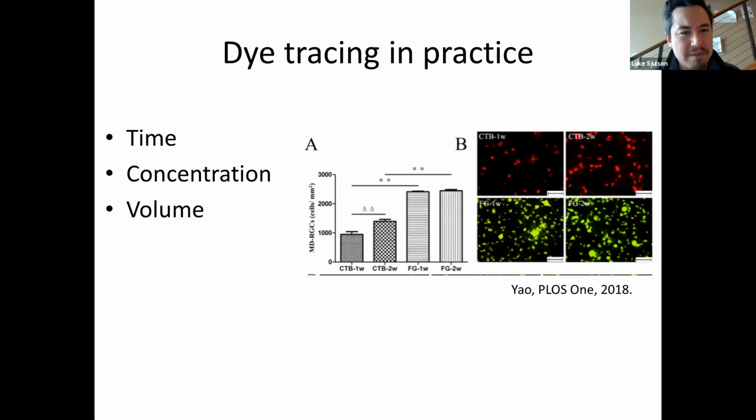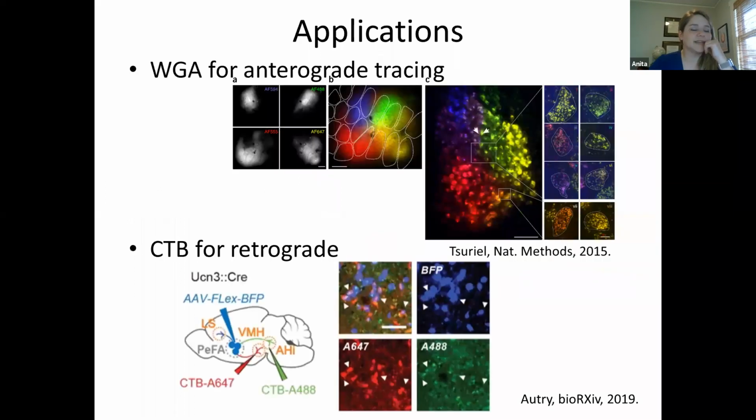And are all of these, you might have said this and I just missed it earlier, are all of these transsynaptic? The dyes typically are not transsynaptic. They can't bud off of a cell and infect the next cell. Right. Okay, but then the WGA is transsynaptic though, right? I think there's some thought that it can be.